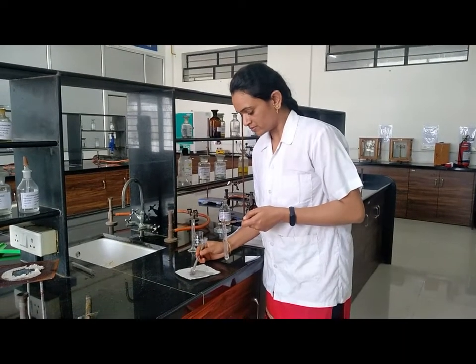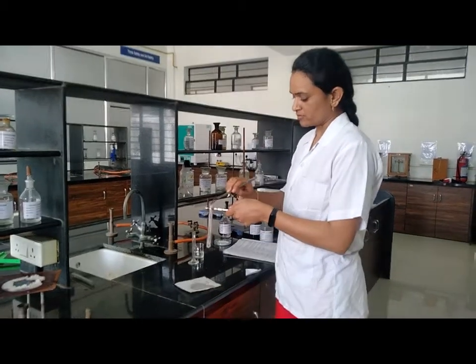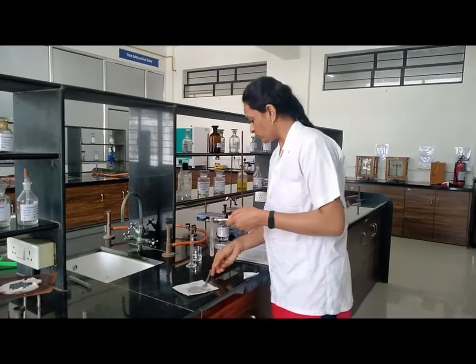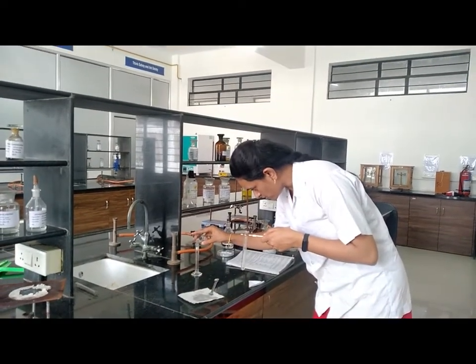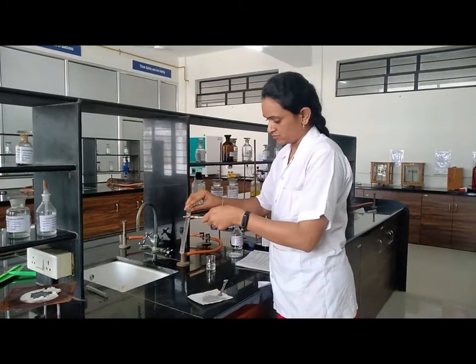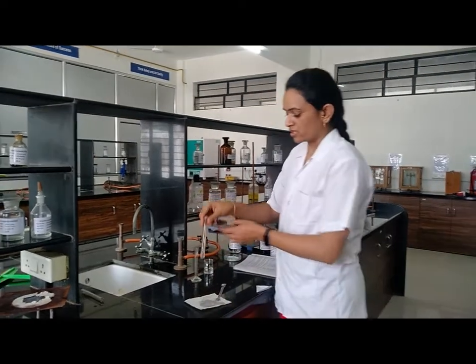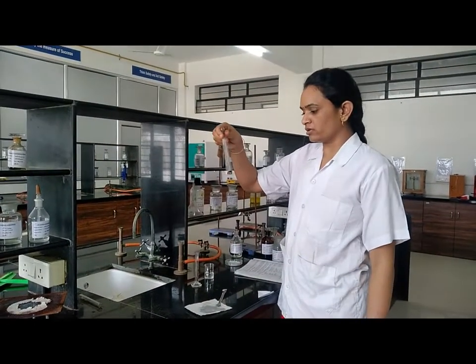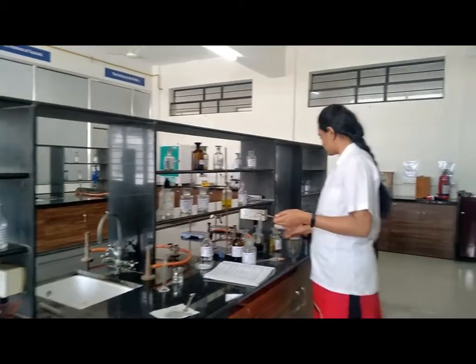Now take this crystalline powder into the test tube and dissolve it in 2 ml of water. We have to take 2 ml of water for dissolving purpose. Now this white crystalline powder is dissolved in 2 ml water. Now add ferric chloride solution.